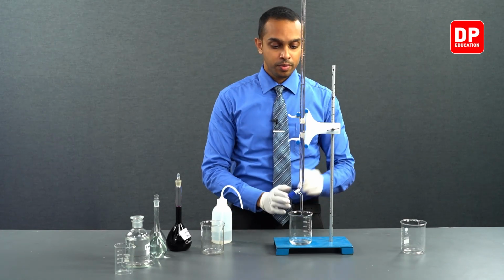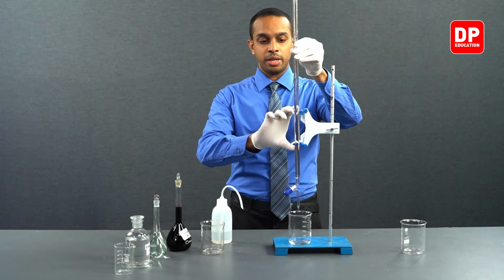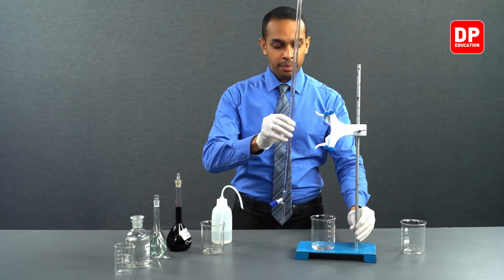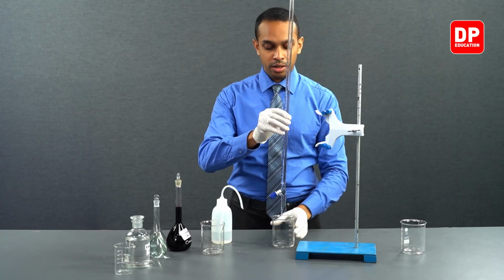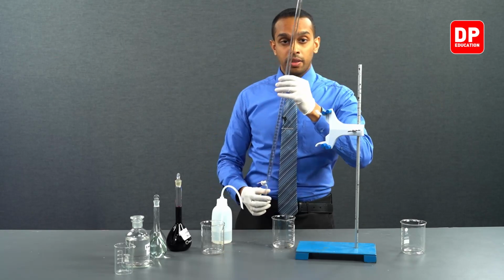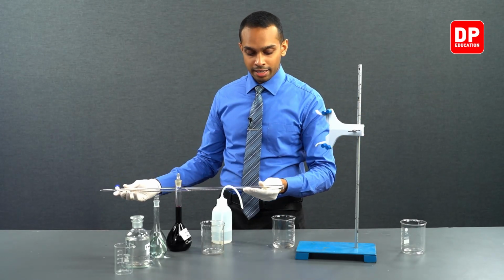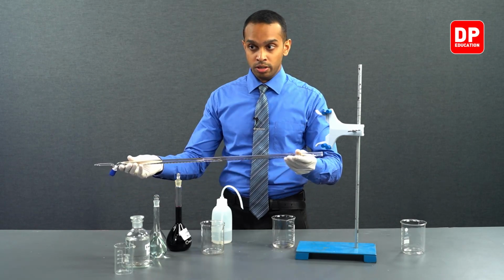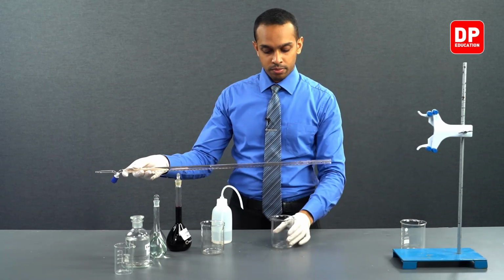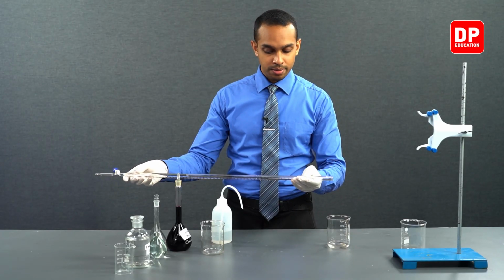And then we will remove the burette from the retort stand, and make sure that we don't spill a lot of water. Then we'll turn the burette sideways and wash the interior walls of the burette by rotating it like this.